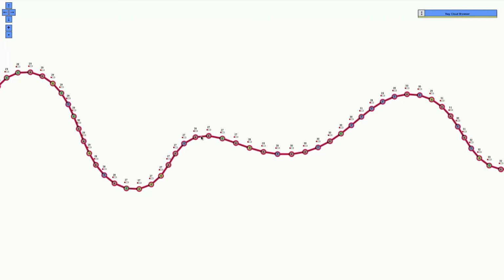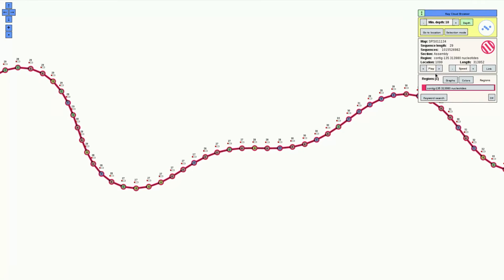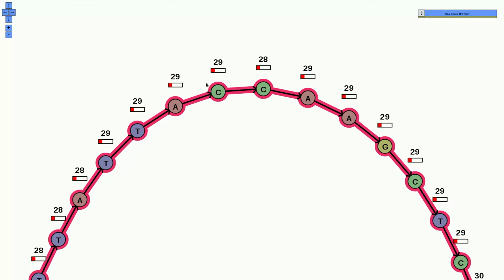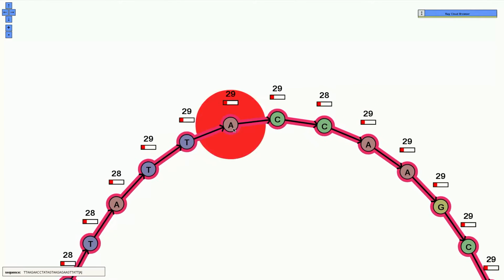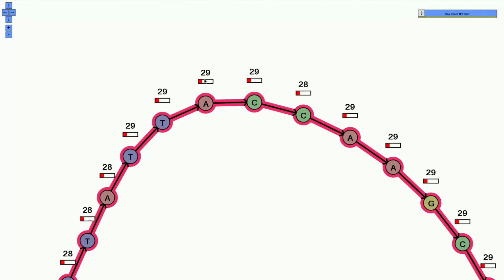The colored paths we see were computed by Ray, which is an assembly software for genomic analysis. Hovering over a circle shows us its true sequence in the bottom left corner. Also, the life bar on top of each circle represents its abundancy in the sample.